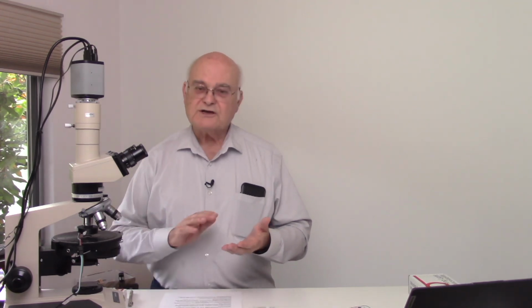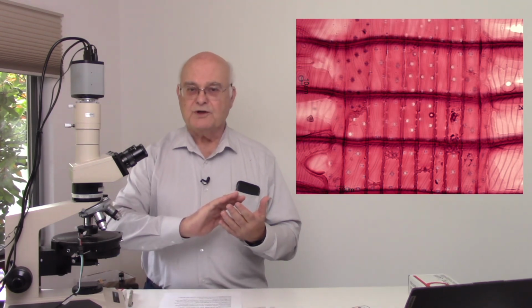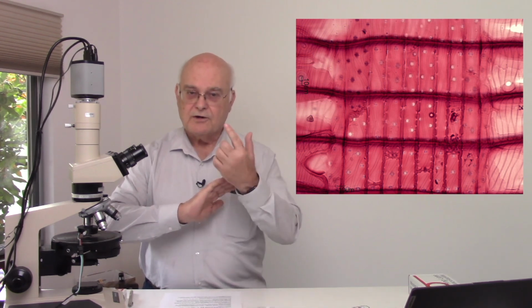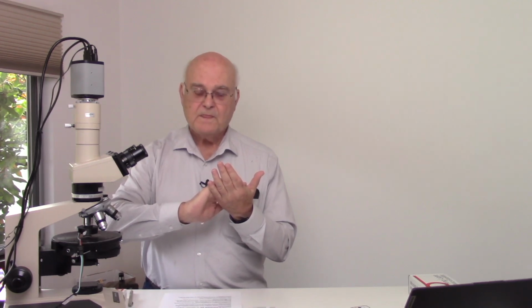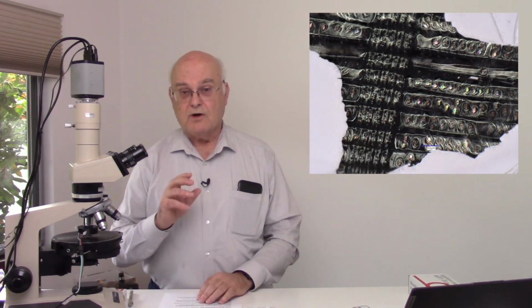The softwood plants have what are called cross-field pitting patterns, where the rays that come out from deeper in the wood cross the linear cells, the tracheid fibers of the wood. Where they cross, you get characteristic patterns in what are called the cross-field pits. Those can help you identify the species of the tree if necessary, or at least the family.